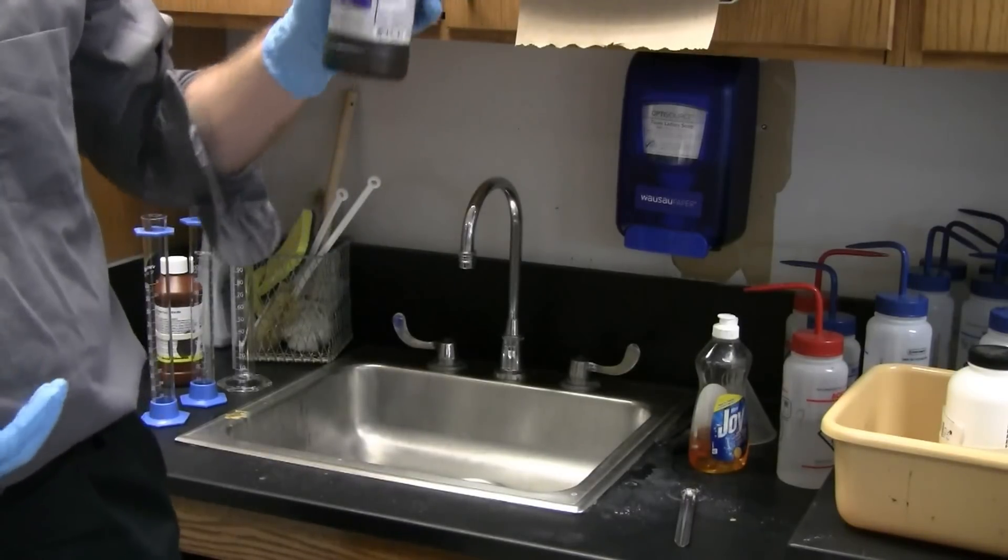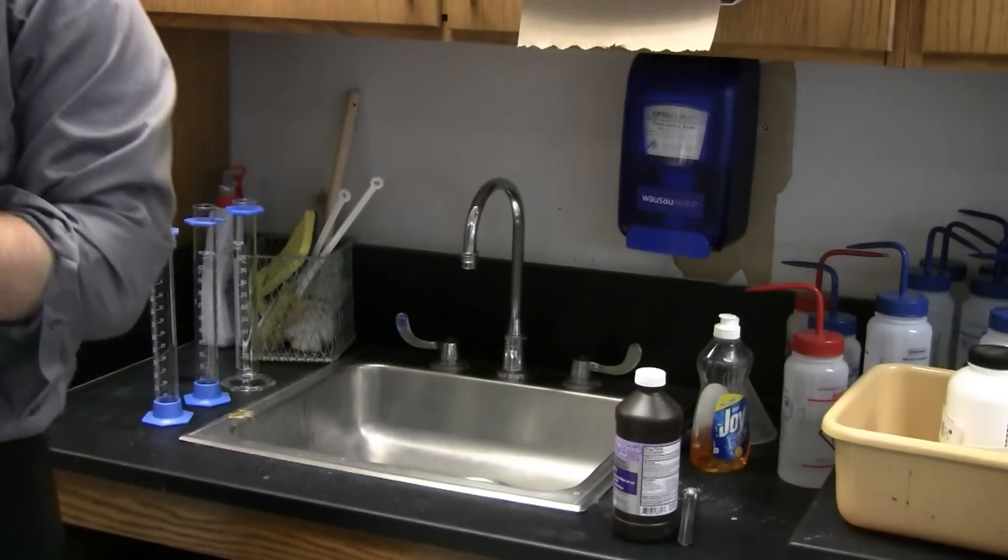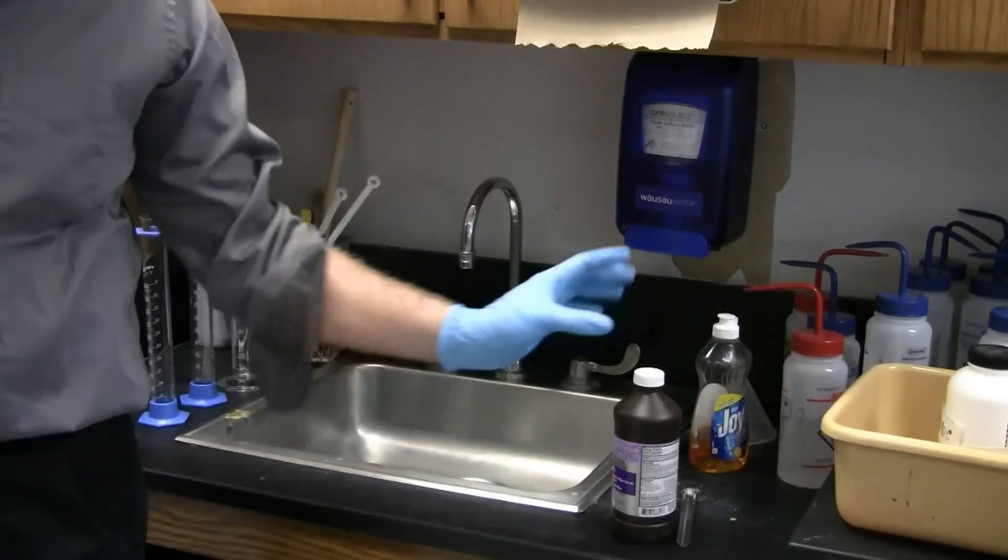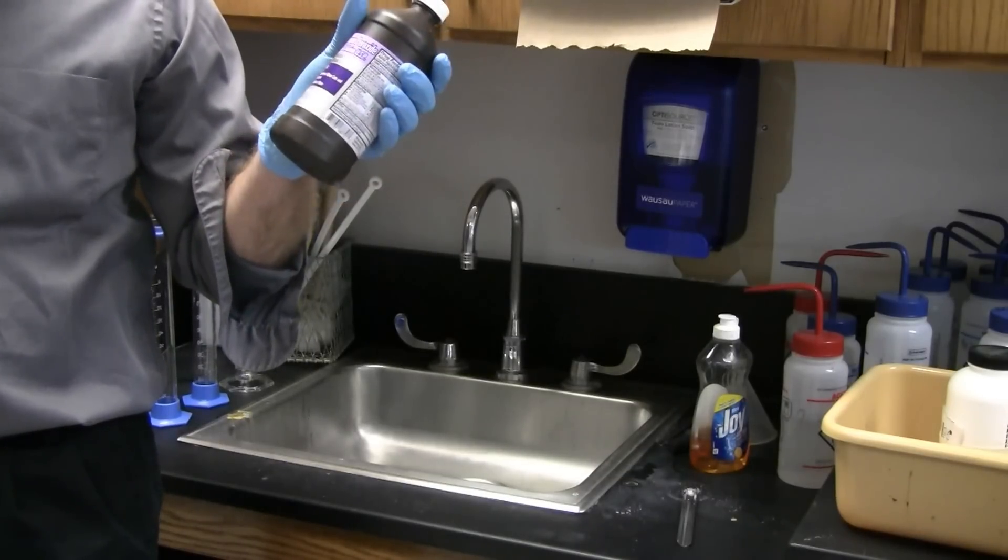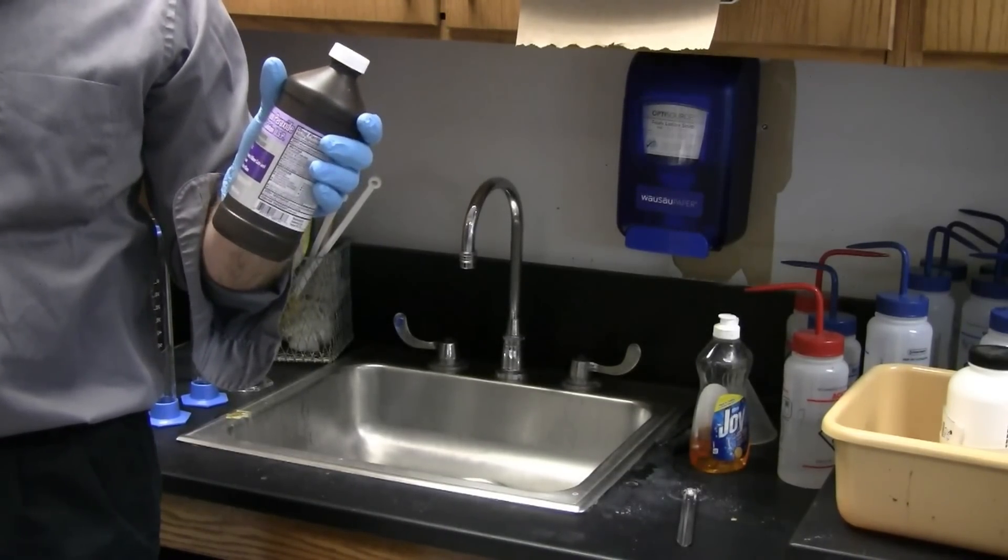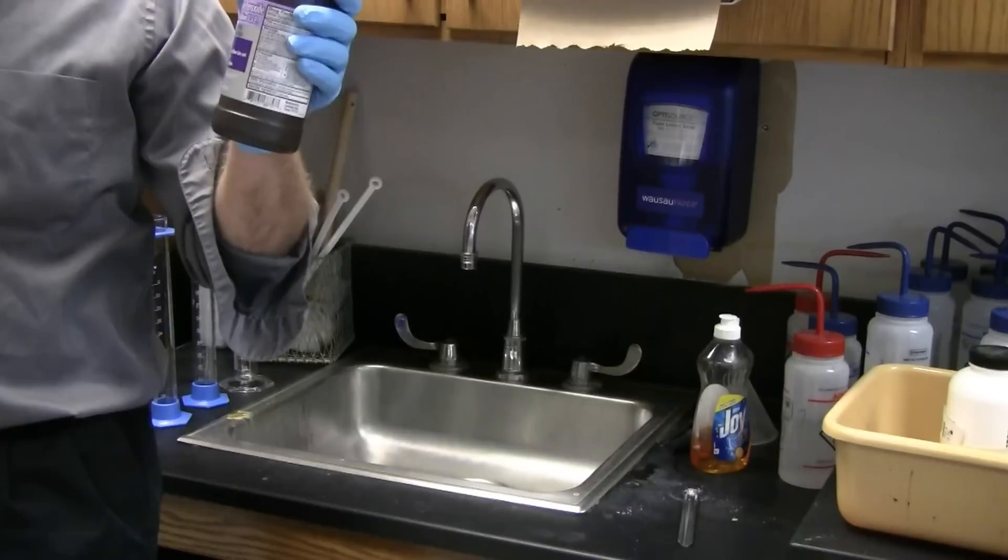So that's the common 3% variety. We also have 30%, which is a little bit more concentrated. So if this is 3% hydrogen peroxide, that means it's 97% water. 30% hydrogen peroxide is 70% water. So you can see these are a little bit different compositions.